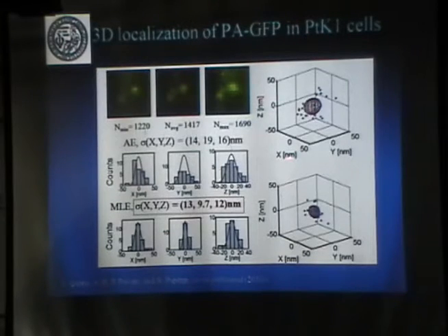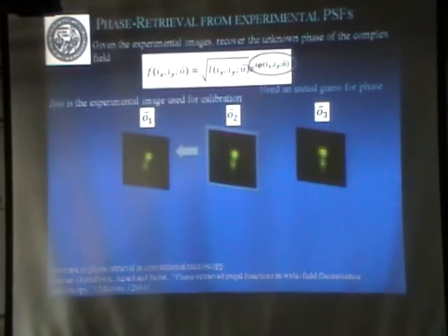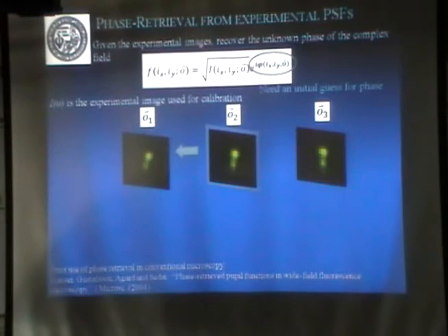This is another example. Again, you go from this to this. So these estimators are more complicated. It's more signal processing, but it's better. Okay, when we do this calibration, I'm going to talk about this.